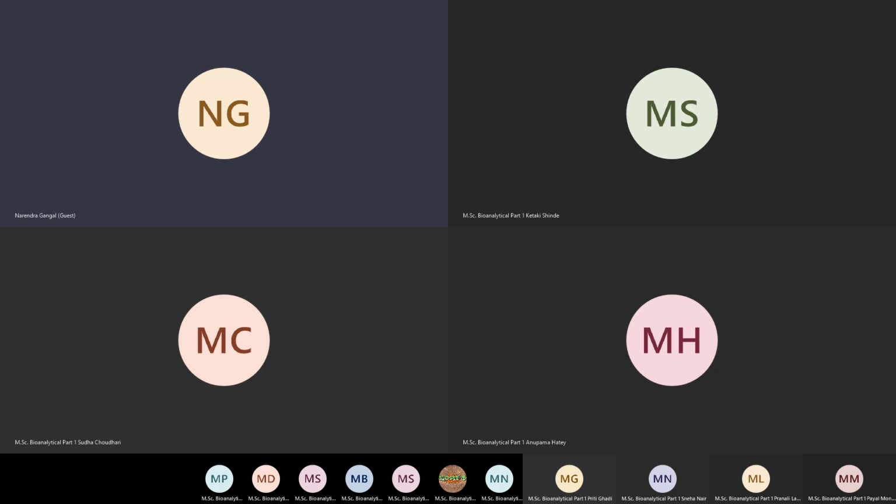This is what we saw. Then one more topic we saw was negative ion chemical ionization, whereby those species which are electronegative in nature, instead of one electron getting dislodged, may capture the electron. Whether an electron gets dislodged or captured completely depends upon the electronegativity of that particular molecule. If the molecule is too electronegative, it will always love the electrons, and instead of an electron getting dislodged, it will capture the electron and may become a negative ion.